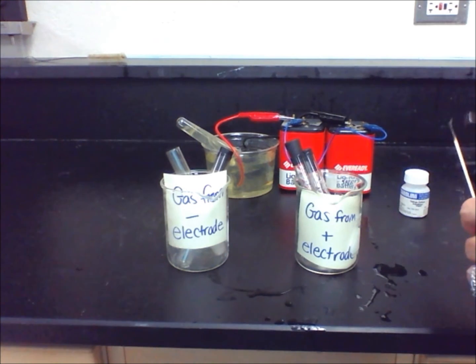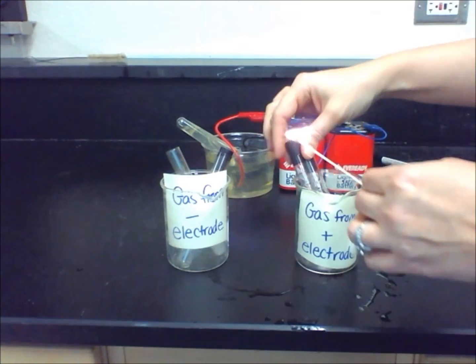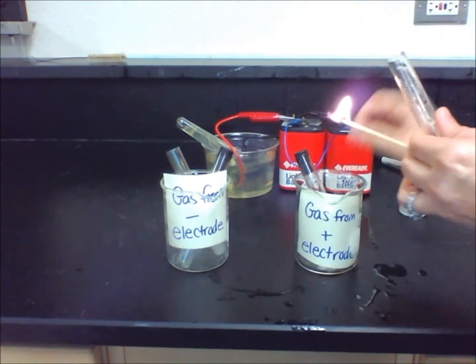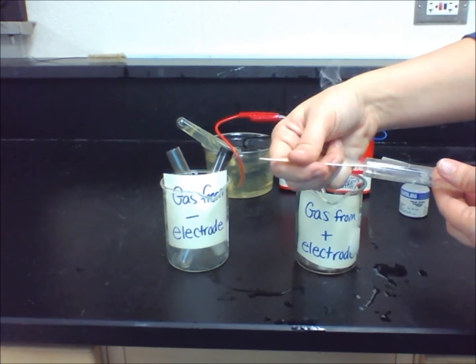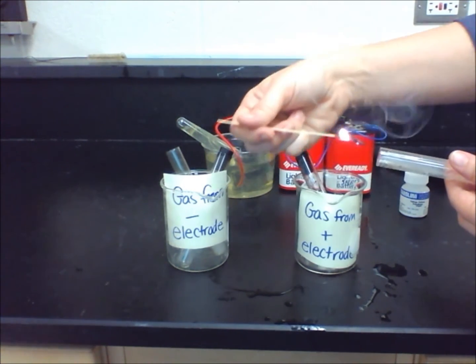In Table 1, when I test the gas collected from the positive electrode with the burning splint, you will notice that it burns slightly brighter and continues to burn, but does not make a lot of noise. Please record this information in the Table about Tube 2.